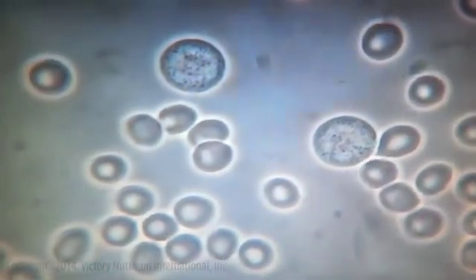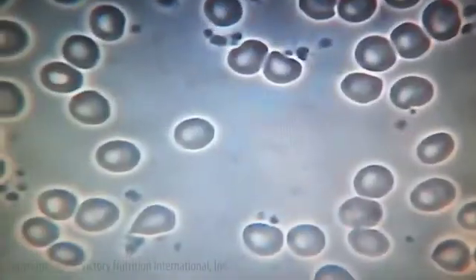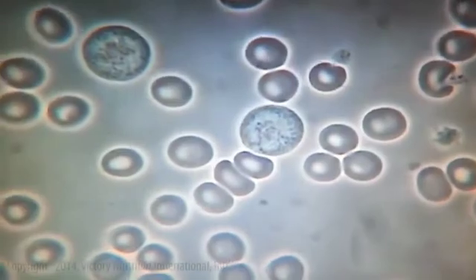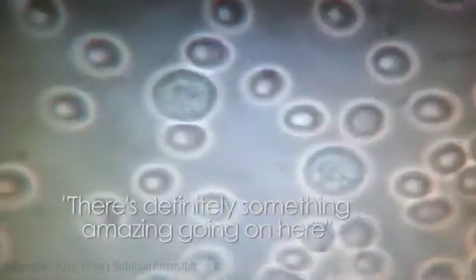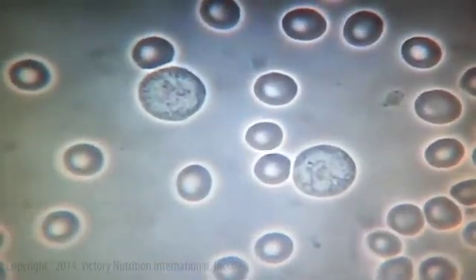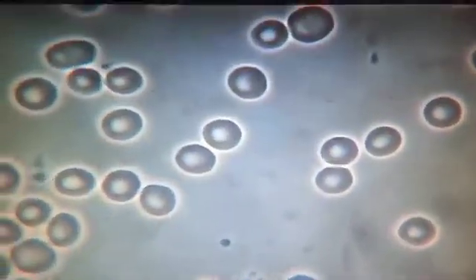To me that's absolutely amazing, and I've been doing this for 14 years and over 40,000 sessions. I've never seen a product that changes the blood like this — I've certainly seen it change in three or four months, but not in five minutes. There's definitely something amazing going on here. The white blood cells are four times as big, the red blood cells are loose and free-flowing — it almost looks like somebody totally different.